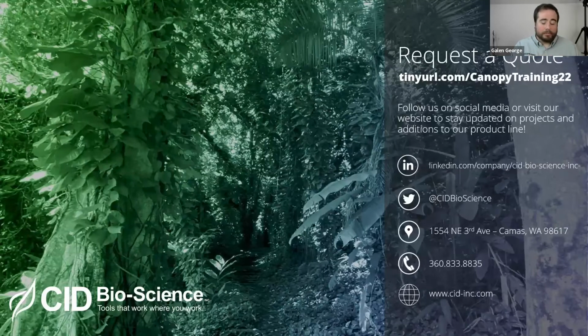We talked about how you can remove the actual lens cap physically and put in physical filters. We include 2 neutral density filters. So if you want to keep that exposure really high, but you have really, really bright conditions, you can easily pop a neutral density filter right into that camera, enter the optical density into the instrument, and you should be good to go.